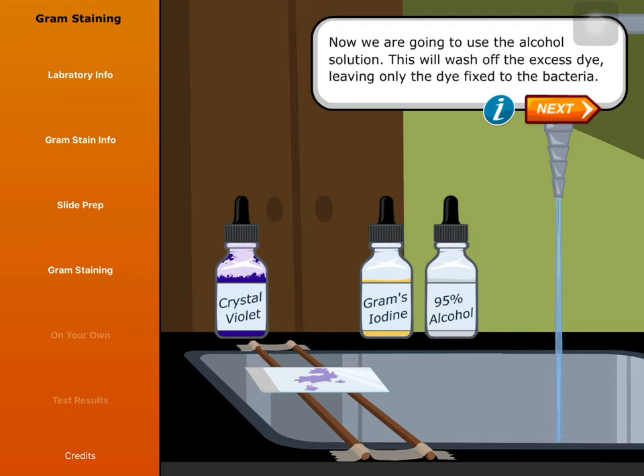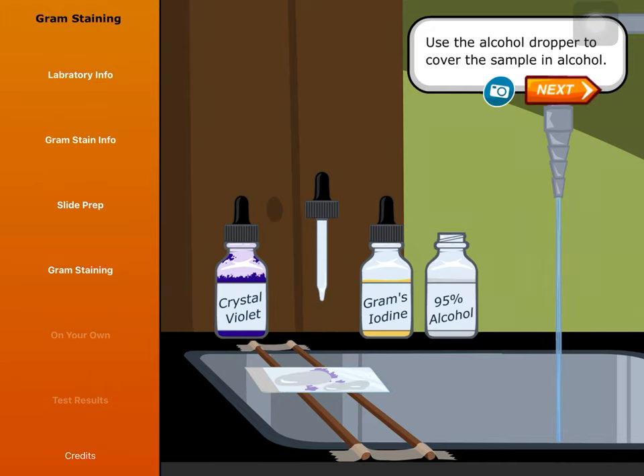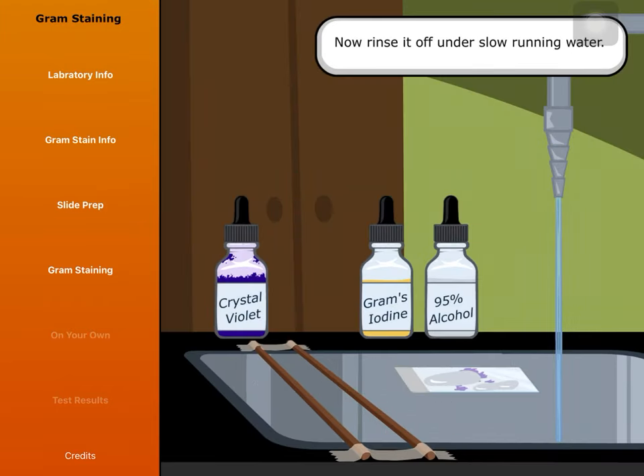Now we are going to use the alcohol solution. This will wash off the excess dye, leaving only the dye fixed to the bacteria. Use the alcohol dropper to cover the sample in alcohol. Let the alcohol sit for 30 seconds — time is very important in this step. Don't let the alcohol sit for more than 30 seconds. Now rinse it off under slow running water.